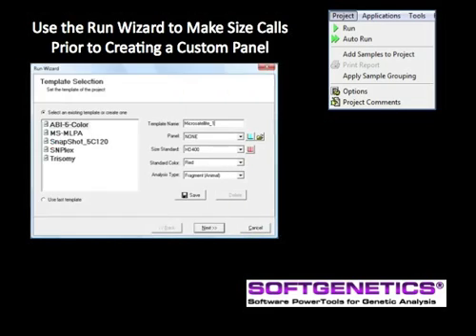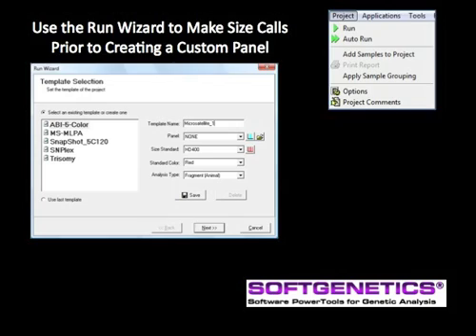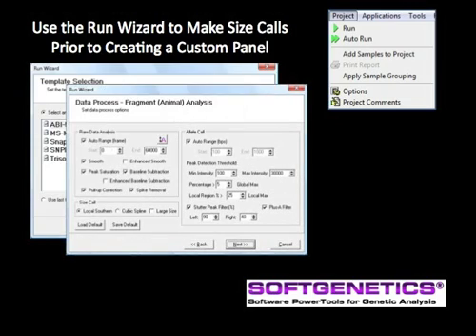In the first screen of the run wizard, select the radio button to create a new template. Type in the desired template name. For this first run, leave the panel selection at none. Select the size standard, size color, and analysis type from the drop-down menu, and then click OK.